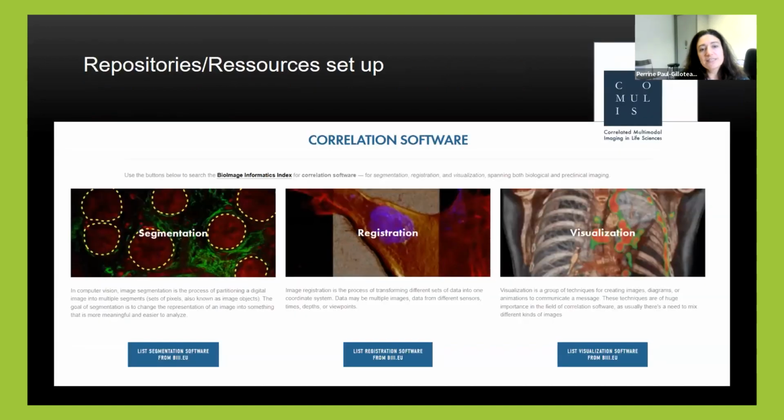So among the different activities, I was saying we have been setting up a repository to help people know what software can be used, for example. This is based on another repository that was done under the auspices of NUBIAS, the Bioimage Informatics Index.